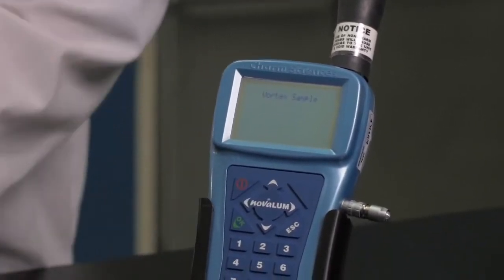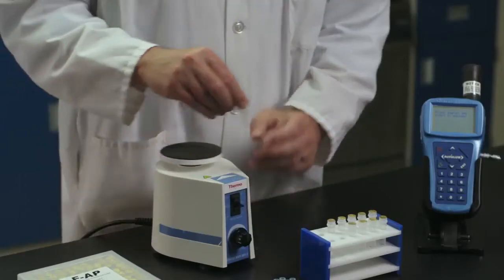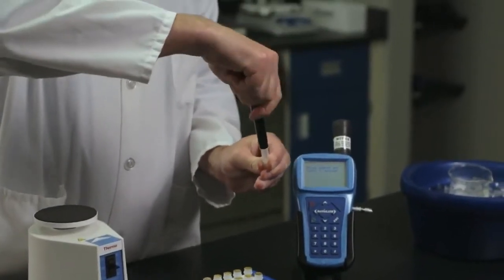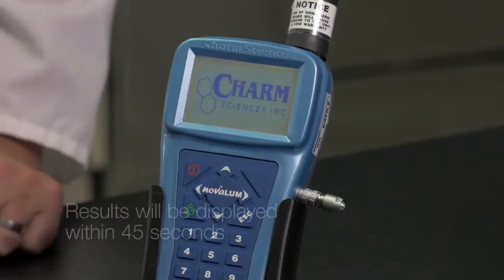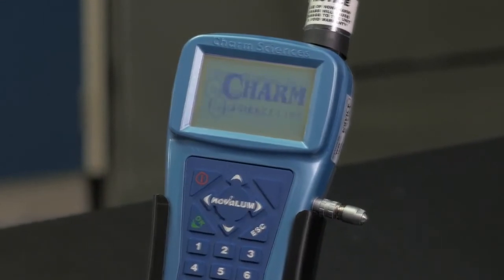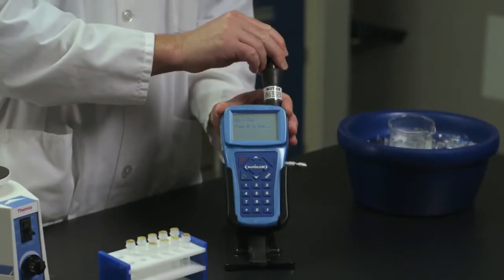The Novolume screen will prompt you to use the Vortex mixer. Thoroughly mix your sample with the Vortex mixer for a full 5 seconds. You will have 30 seconds to complete the mixing, attach the adapter to the vial, and insert it into the Novolume before the next screen prompt appears. The negative calibrator value is used by the Novolume to adjust the channel calibration. Results will be displayed on the screen — here, a result of 1,124 RLU is displayed.